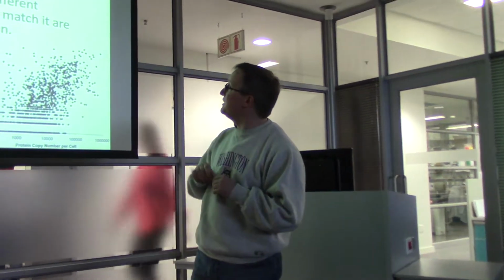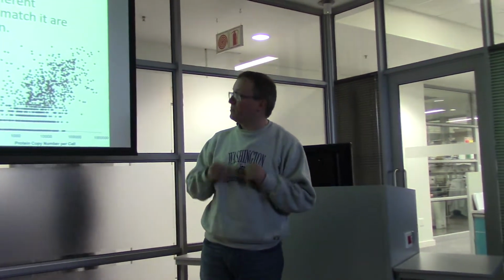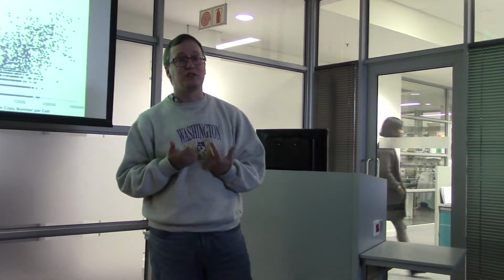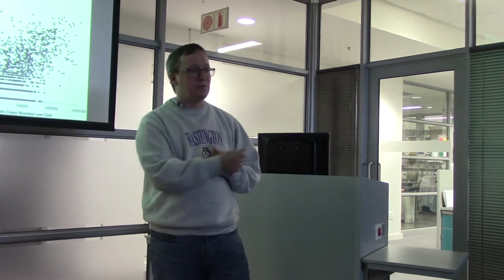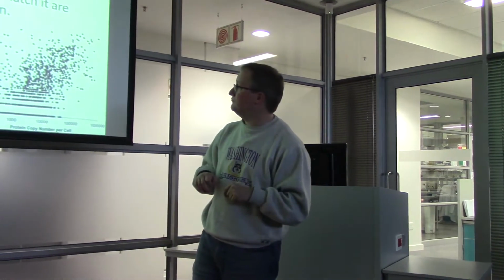If the same protein is observed in different samples, the number of spectra that match to it are predictive of its relative concentration. So if there's twice as much of a protein in one cohort as in the other cohort, and they have otherwise similar compositions, you can detect that the number of spectra has jumped in one cohort versus the other, and learn that that protein has changed. Okay.